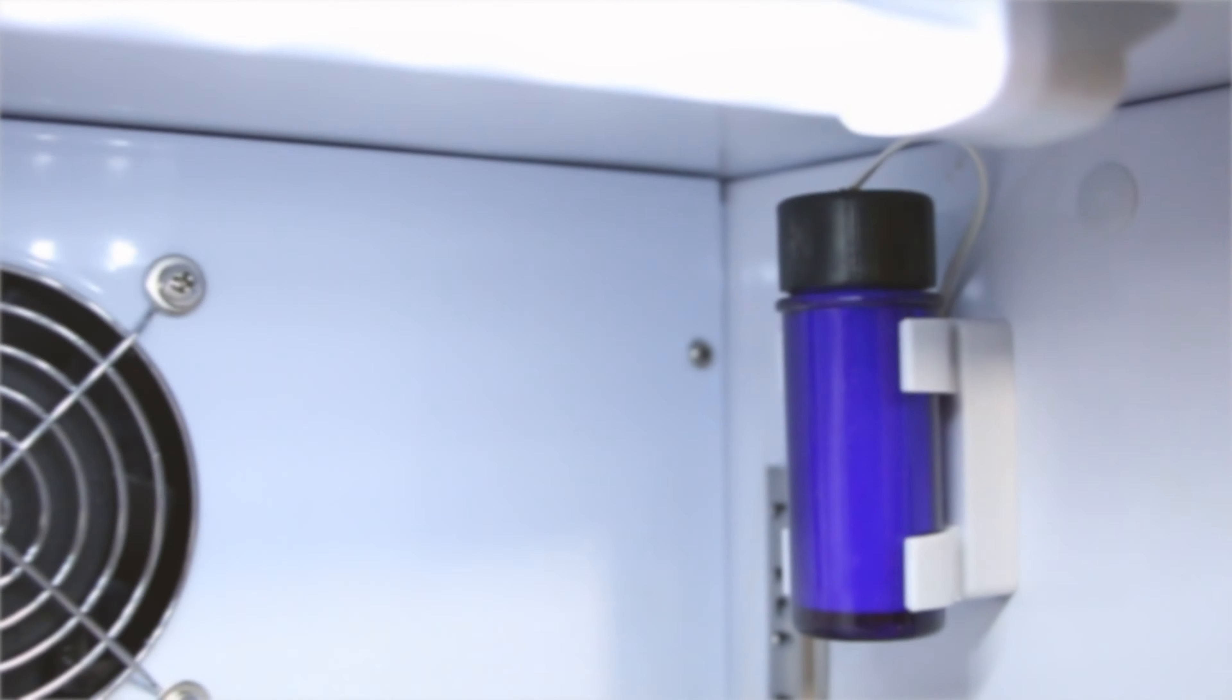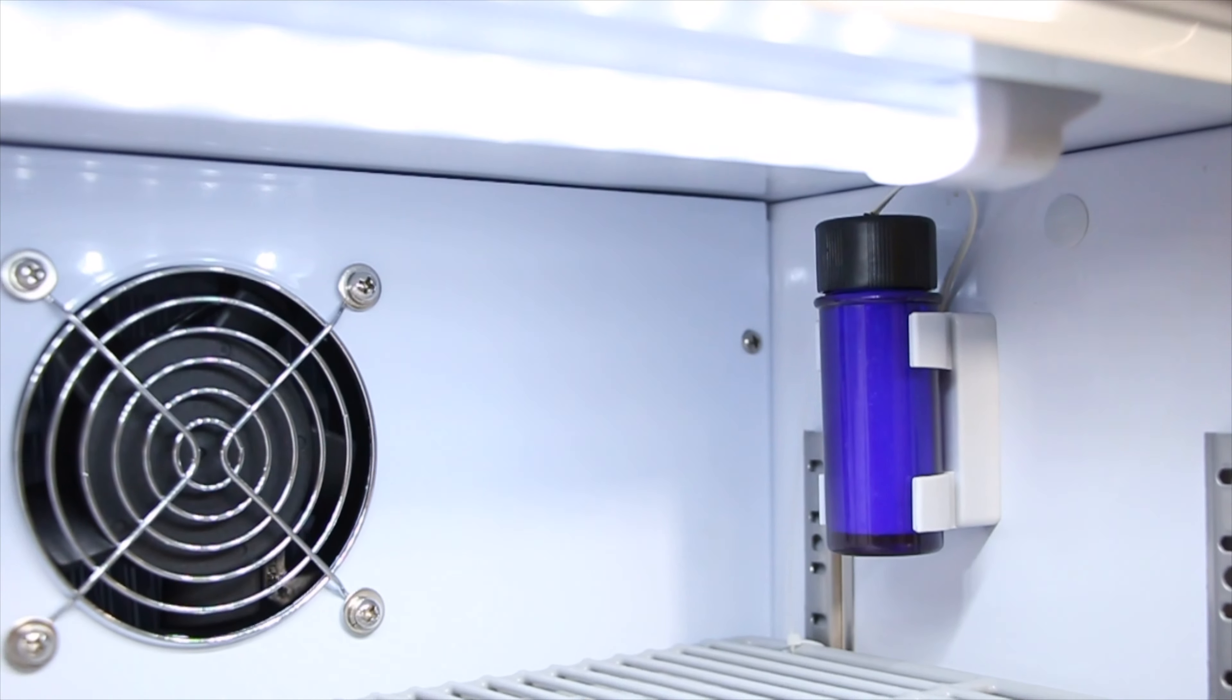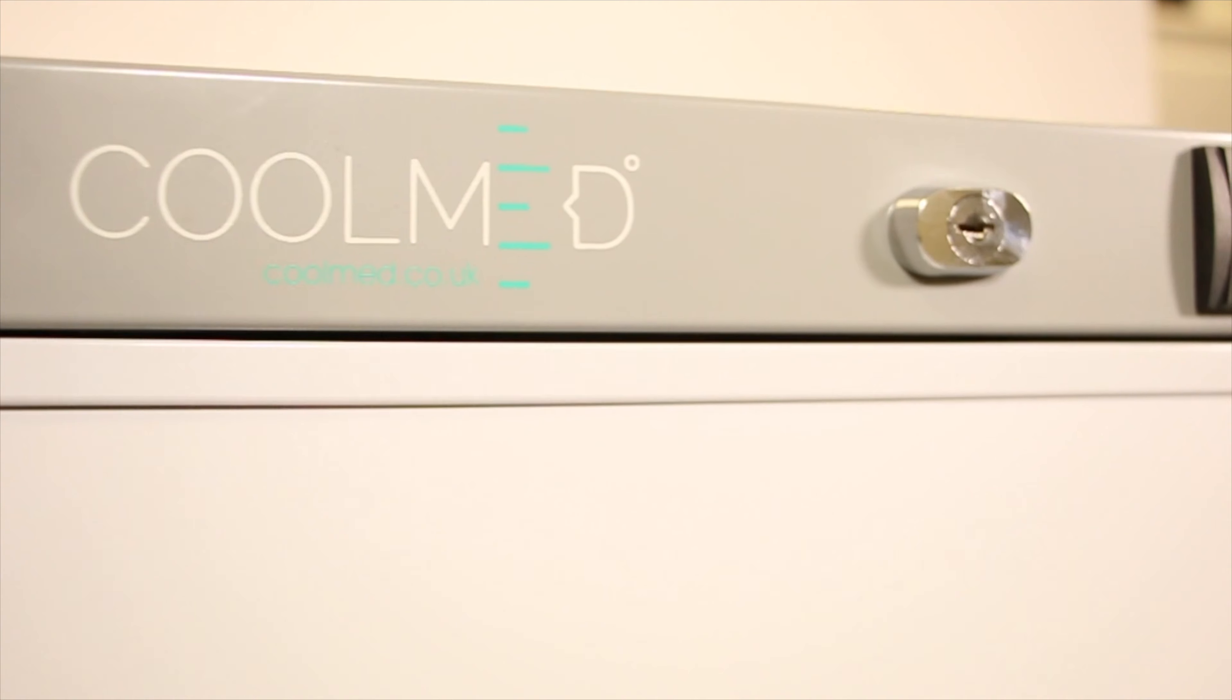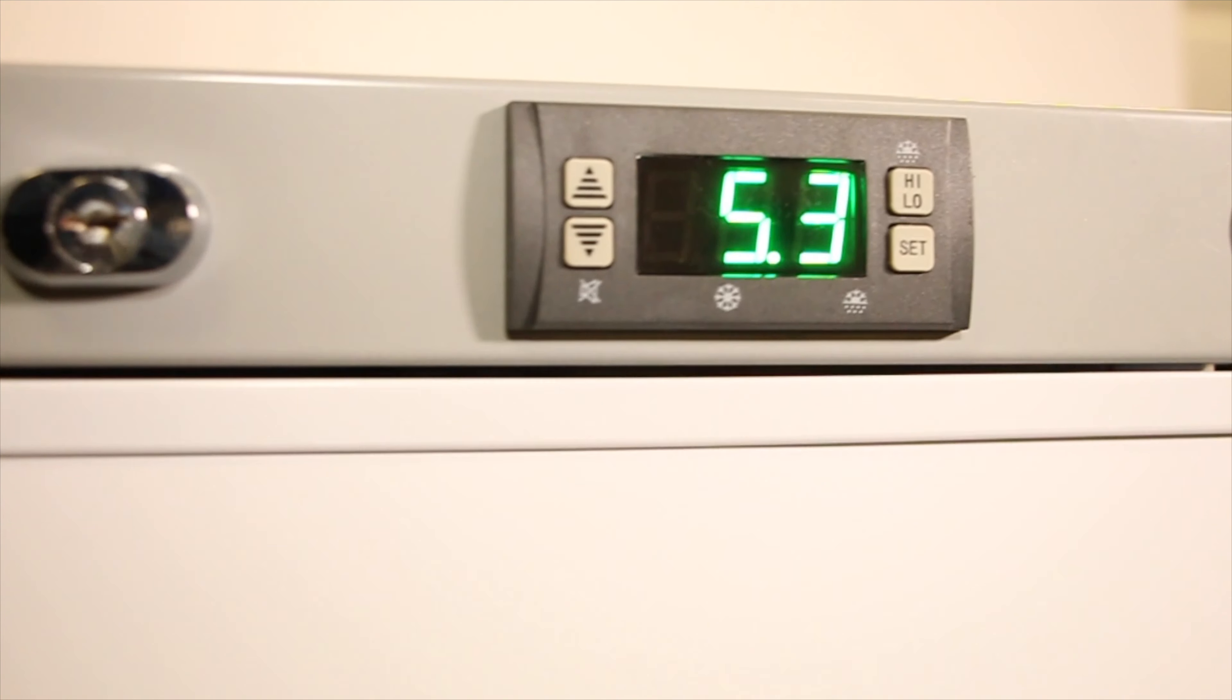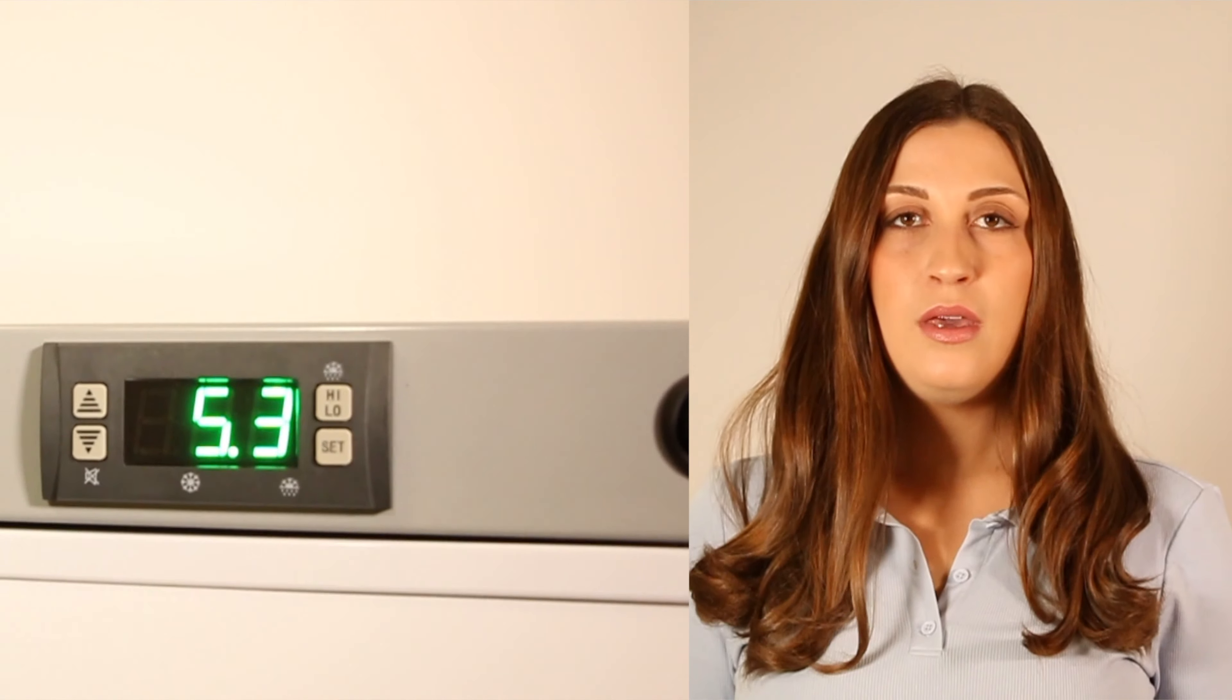This fridge features a built-in temperature probe which accurately monitors and stabilizes fridge temperatures. The temperature is factory set between two and eight degrees. You can then set the temperature between these points using the controller. The fridge will be preset at five degrees.